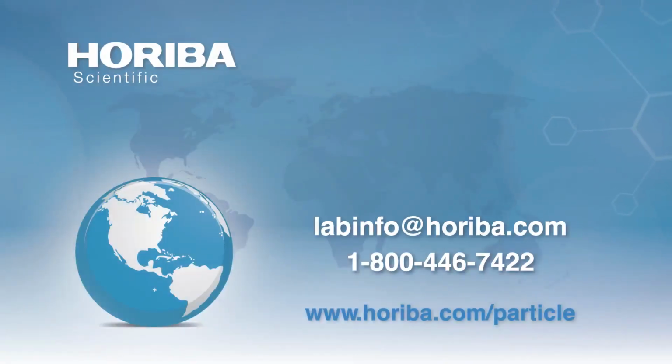Well, thank you, Jeff, for the excellent webinar. I do have one that came in during registration, so I'll probably rephrase. What would be expected of the operator when it comes to system verification on particle size analysis?